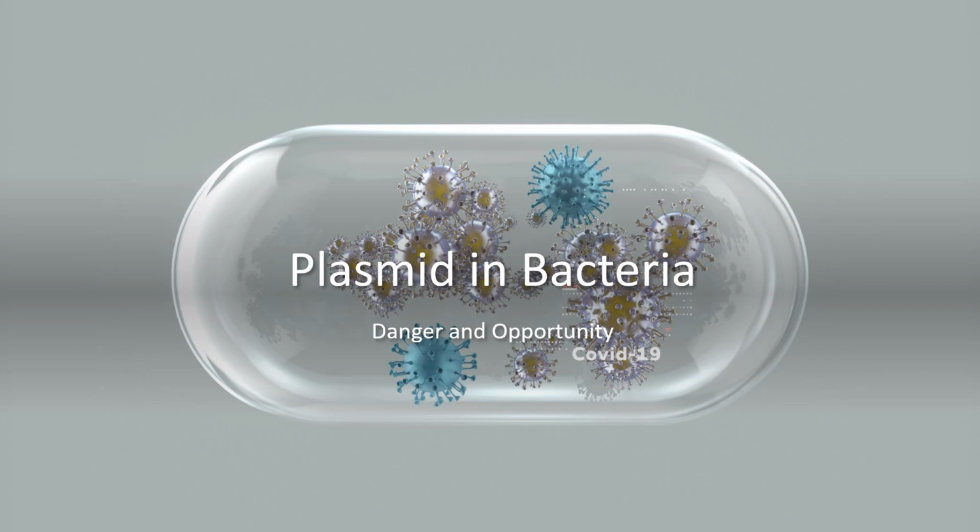Hello everyone, I'm a junior student from Kunshan University. Today, I would like to introduce plasmid in bacteria, how we conducted a relevant lab experiment in Biology 110, and its connections to real-world applications.